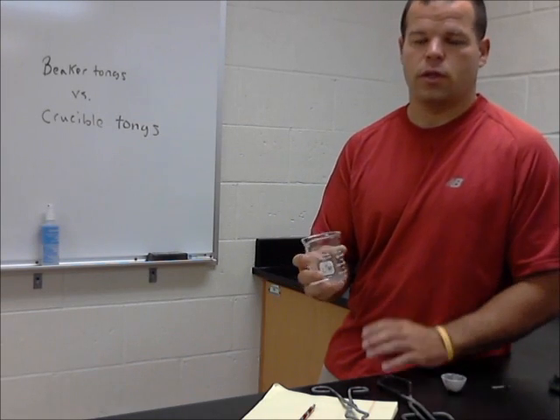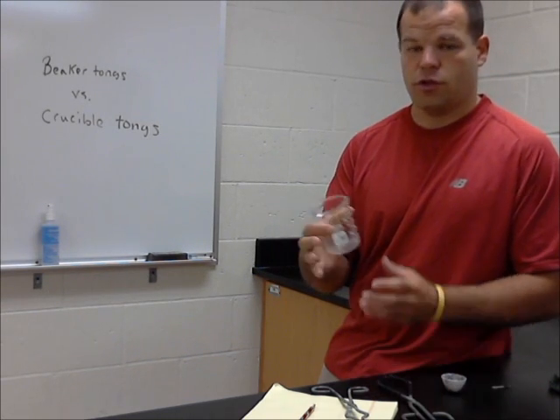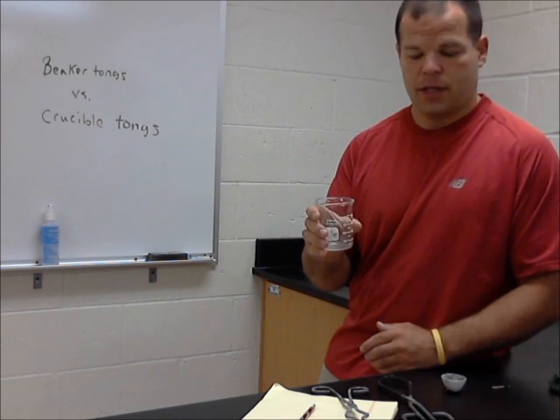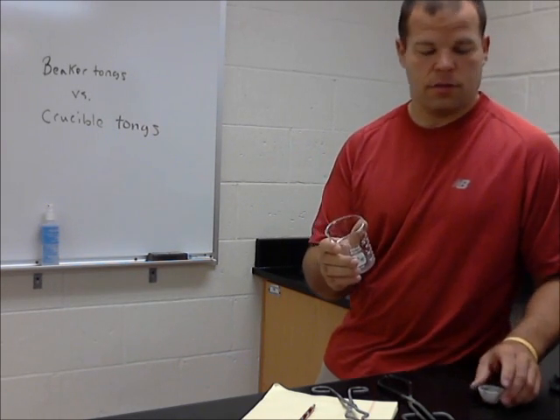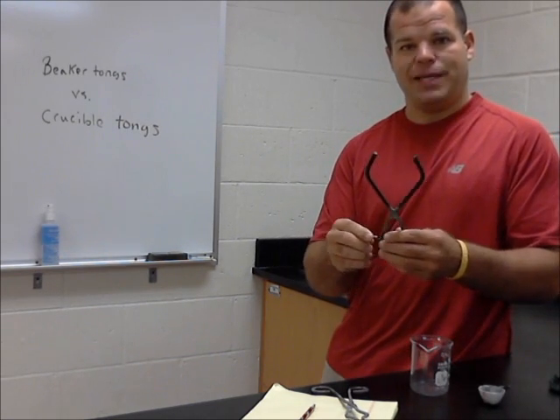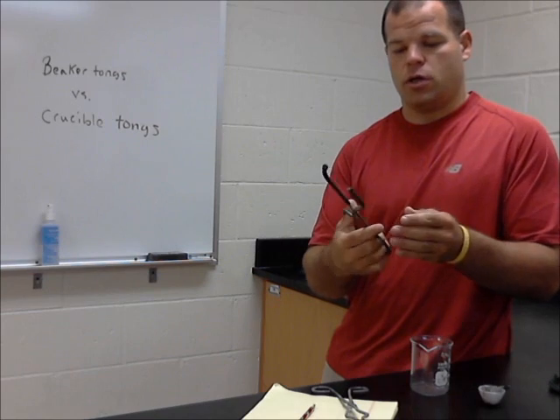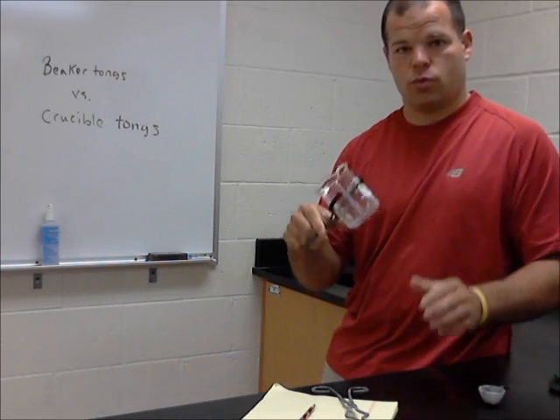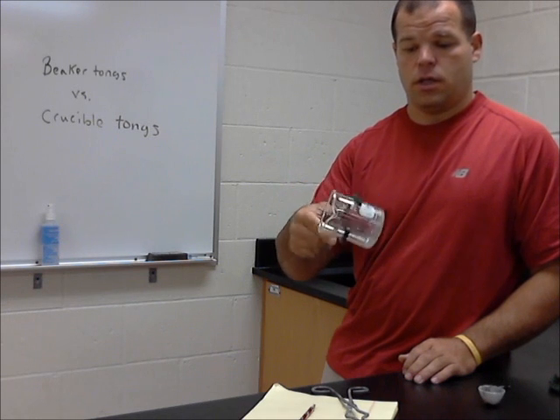Well, if it's cold, you could just pick it up with your hands. Your fingers work quite well in this sense. Got the old opposing thumb, works great. But what if it's hot, which happens a lot? We have a device here called a beaker tongs. The beaker tongs have a rubberized end, and this is designed to fit a beaker, and it works very well. You could pour with this.